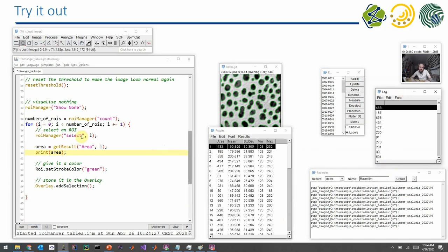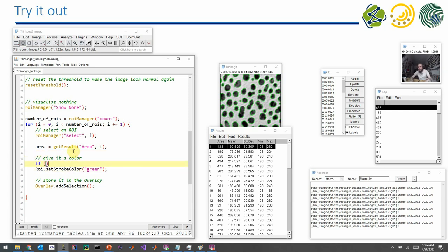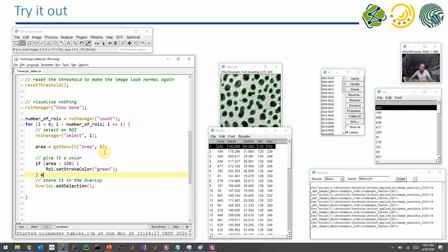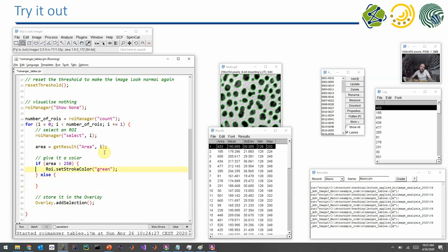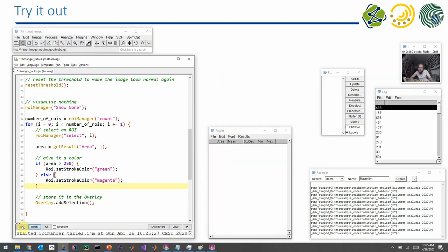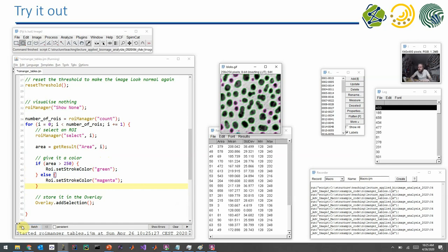You see, again, it's becoming many, many windows on the screen. And it's OK. In order to make color dependent on a measurement like area, we have to write an if statement with a condition. And the area, for example, should be larger or smaller a certain value. We can again go through the table and have a look. OK, the values are between 100 and 500. That's why we can write something like 250. And if the area is larger than 250, we make it green. And otherwise we make it magenta. Here you see now, dependent on the area, we see the ROI in different colors.